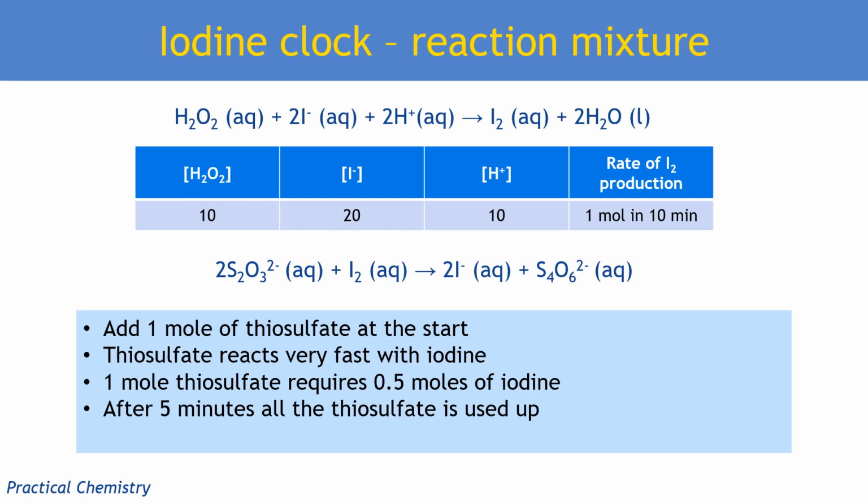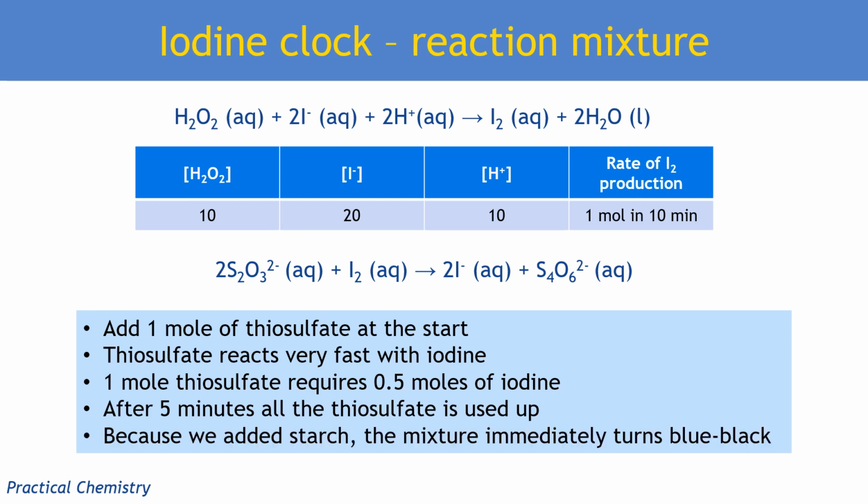However, remember we added 2 things. We didn't just add thiosulfate, we also added starch. At the beginning, nothing's happening because the iodine is getting used up by the thiosulfate. The moment that 5 minutes is up, my thiosulfate is used up, iodine is released into the reaction mixture and reacts with starch to make a blue-black, very obvious change. So the change is going from colourless to blue-black. I can see it very, very clearly. I know exactly when to stop my stopwatch.